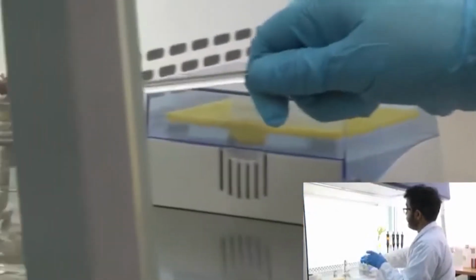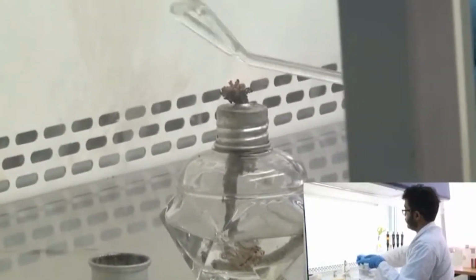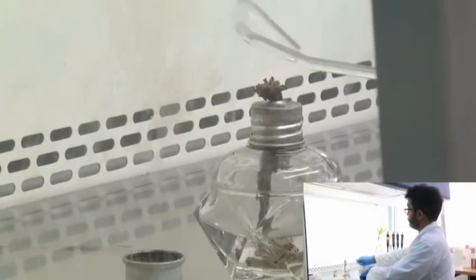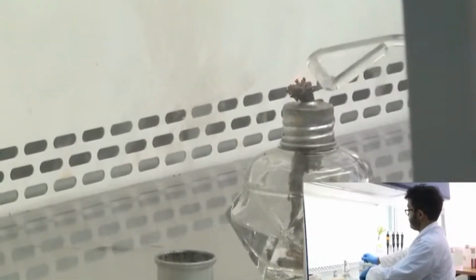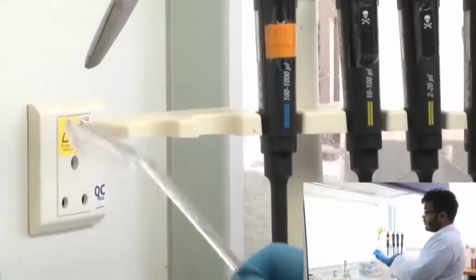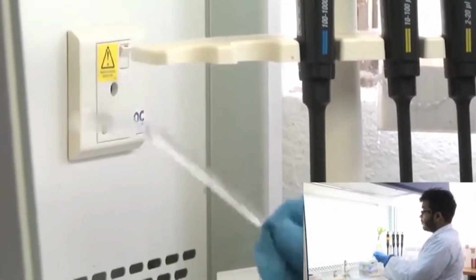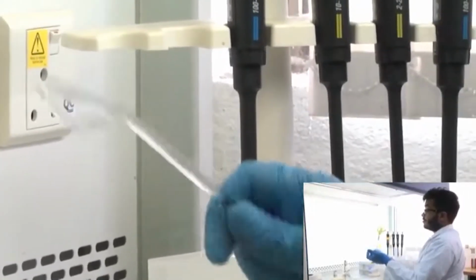My spreader was dipped in 70% ethanol, it's sterilized, and now I'm getting rid of the ethanol. You'll see that the ethanol gets burnt off. You have to be thorough so that there is no residual ethanol left. And then you have to cool the spreader. Initially it had ethanol. If you use that to spread it, you're going to kill your cells, because 70% ethanol is for sterilization. You don't want to kill your cells, that's why you're heating it in the burner. The ethanol being volatile, it just goes away, it gets burnt off.